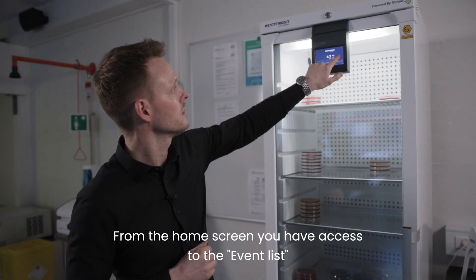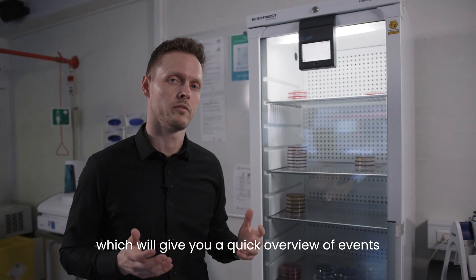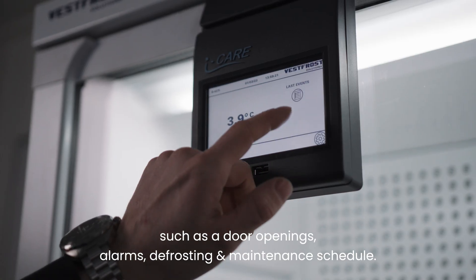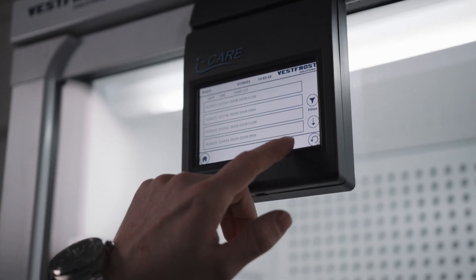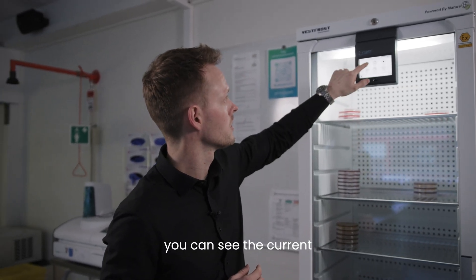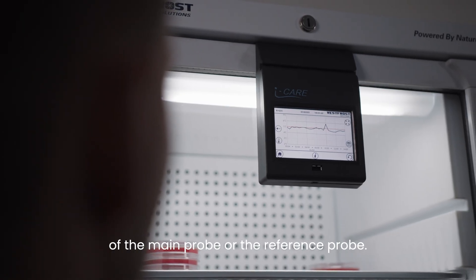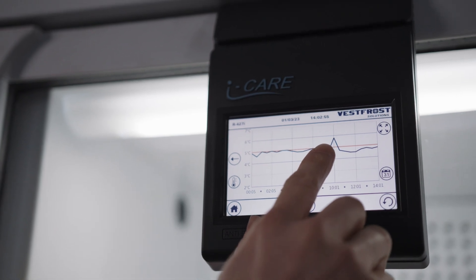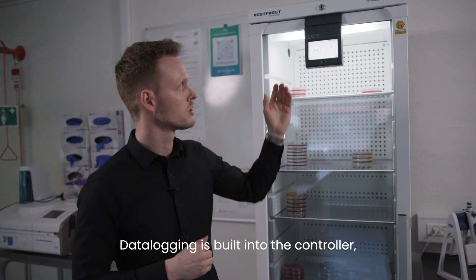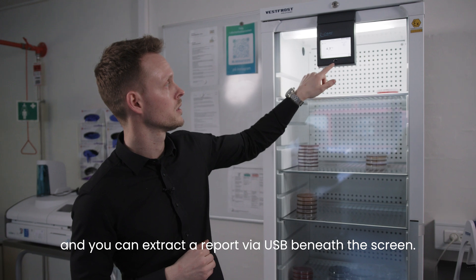From the home screen you have access to the event list, which gives you a quick overview of events such as door openings, alarms, defrosting, or maintenance scheduling. With the temperature graph you can see the current and historical temperature performance of the main probe or the reference probe. Data logging is built into the controller and you can extract a report via USB beneath the screen.